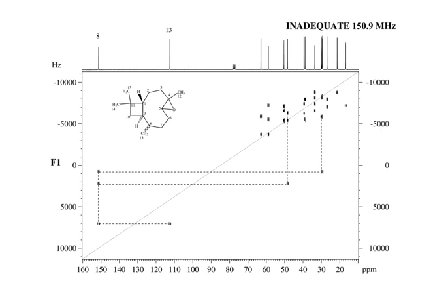A few things that we could pick out here: when we're just assigning, it's best if you can pick out something, and the easiest thing to pick out is the carbons on the double bond.